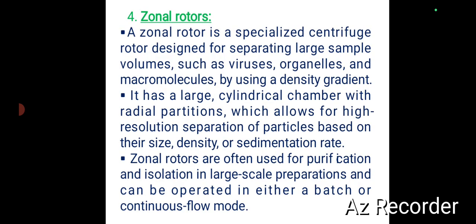Next one, zonal rotors. A zonal rotor is a specialized centrifuge rotor designed for separating large sample volumes such as viruses, organelles, and macromolecules by using a density gradient. This type of rotor is especially used for the density gradient centrifugation technique.